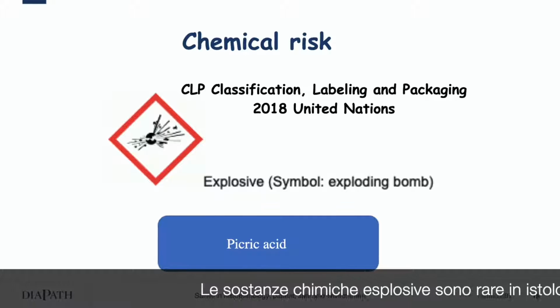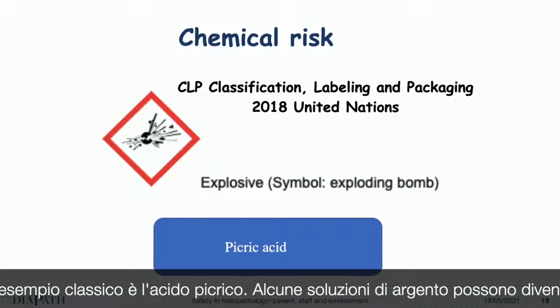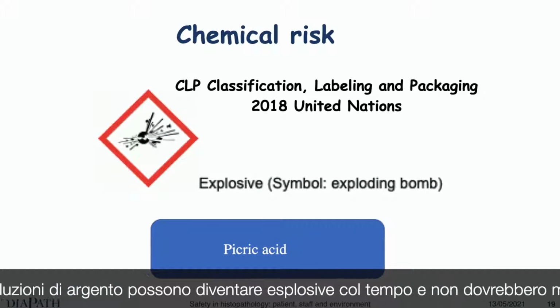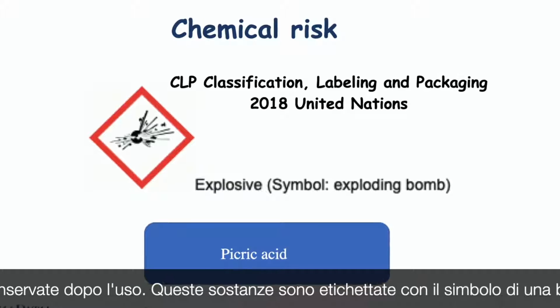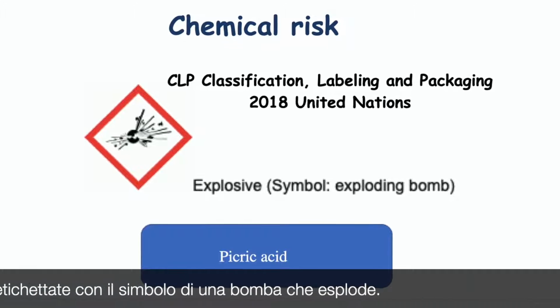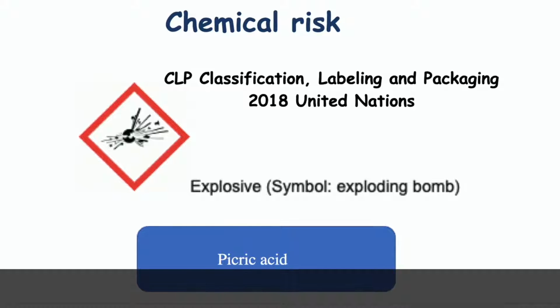Explosive chemicals are rare in histology, but a classic example is picric acid. Some silver solutions may become explosive upon aging, and they should never be stored after use. The substances are labeled with the symbol of an exploding bomb.